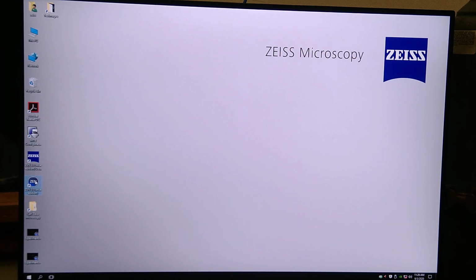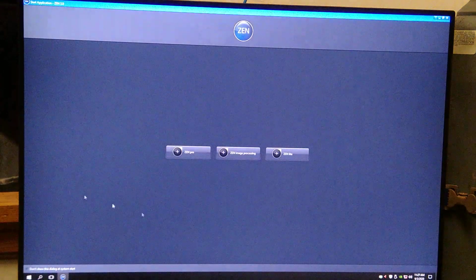For this video, I want to focus on the software. So I've already turned the machine on, following the prompts, following the numbers, 1, 2, 3, 4, the blue stickers. And now I'm going to open the Zen Blue software.